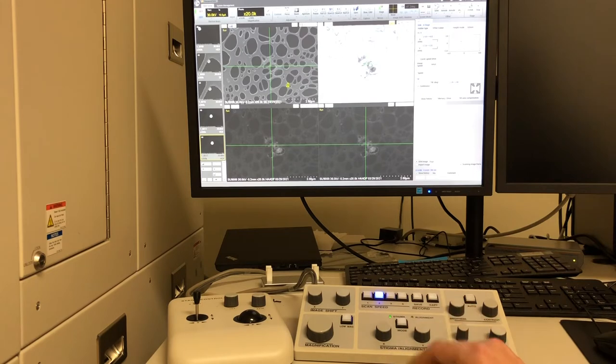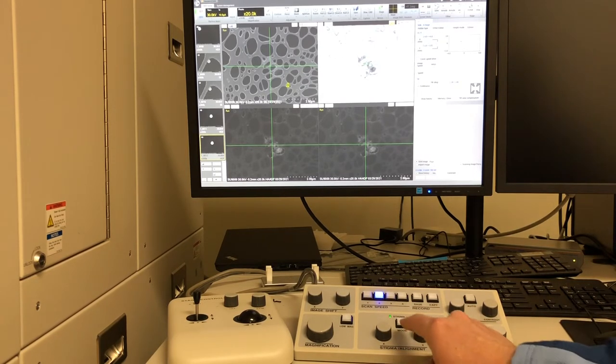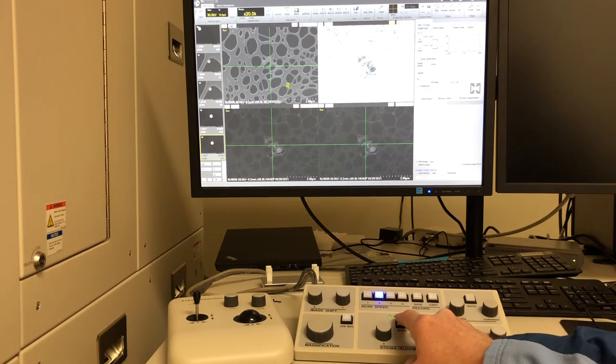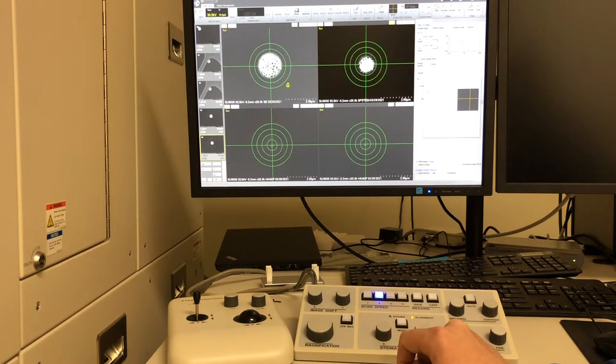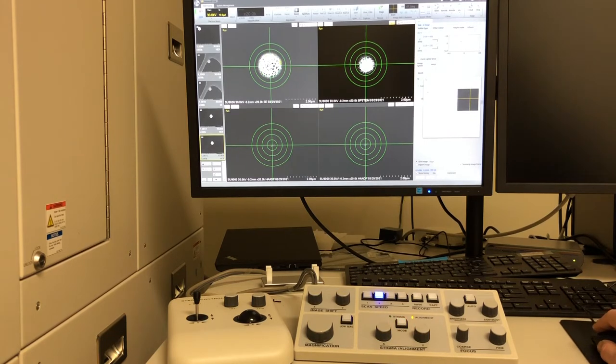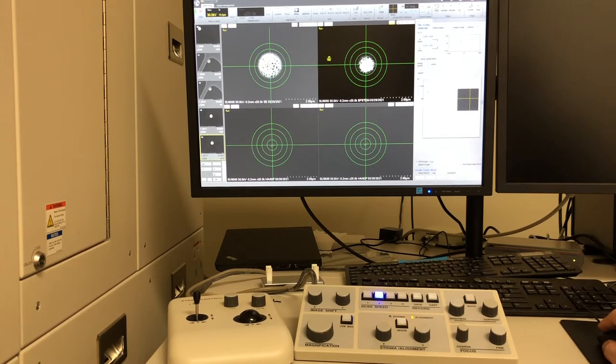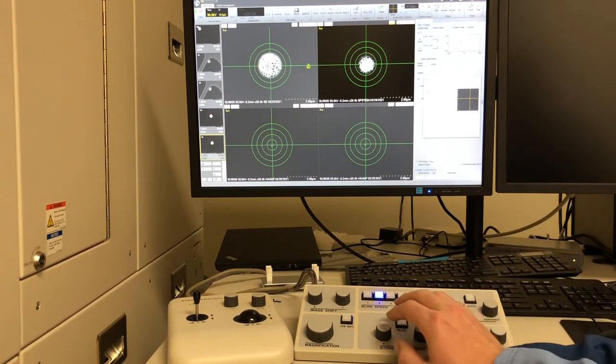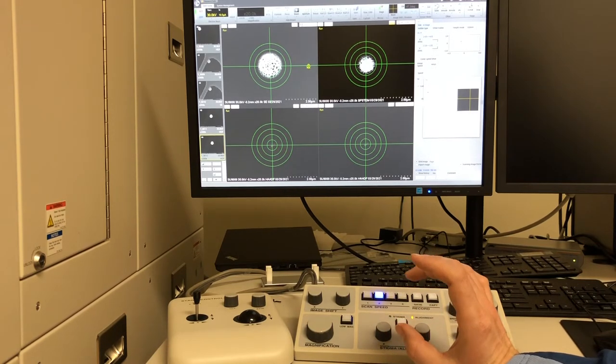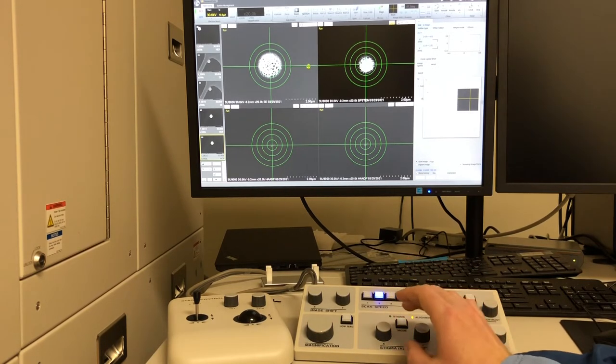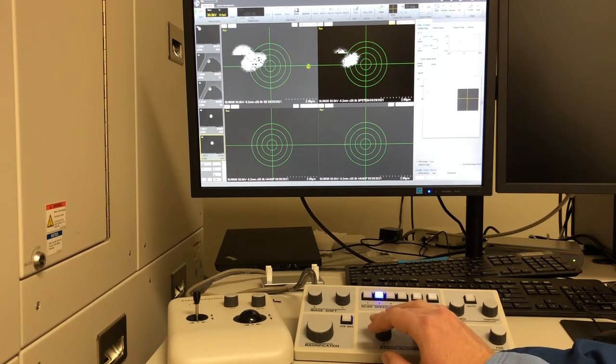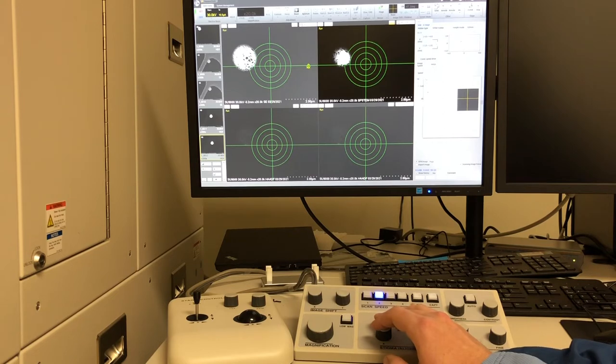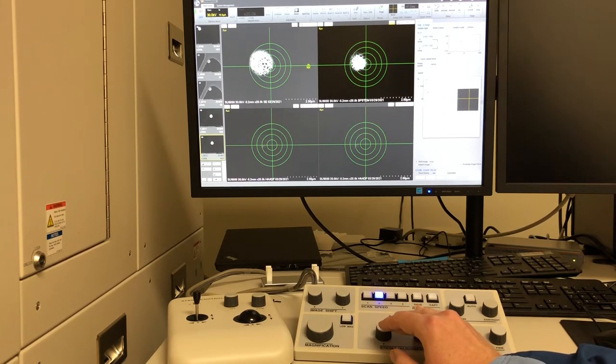And now I'm going to undergo an alignment of the beam. To do that, I will press mode. And then I will be strictly focusing on the SE window and making sure in this first case that the beam is centered to the target that's set up. And it is. If it was off, it might look like this, but then we can correct it with the XY knobs.